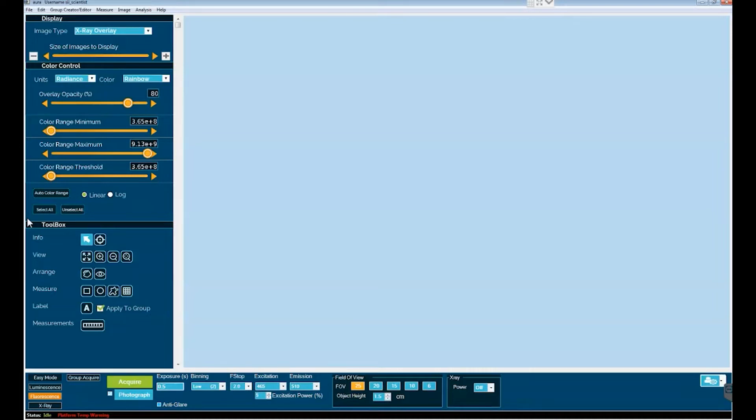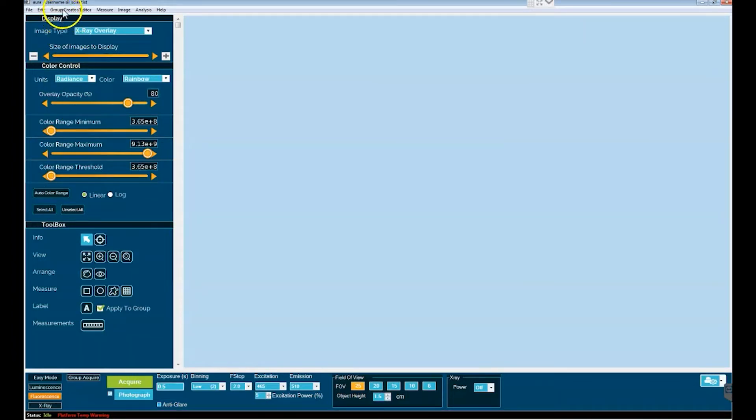So, how does Group Acquire work and how do you set it up? Let's start off by setting up a Group Acquire. This involves going up to the top left-hand corner of the home page of Aura and selecting Group Creator Editor.